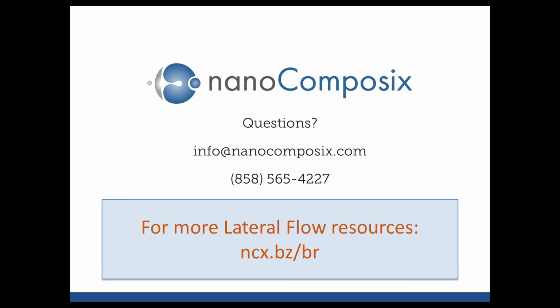I'm not sure if this is referring to blocking the actual nitrocellulose membrane. If it is, I would recommend using very low concentrations of proteins. We usually don't block the nitrocellulose membrane itself. That can cause some issues later in the manufacturing process. As far as other areas to block, I would recommend the same things that Jean mentioned earlier, such as proteins like BSA and casein. Surfactants can help, and also some different types of polymers like PVA and PEG.